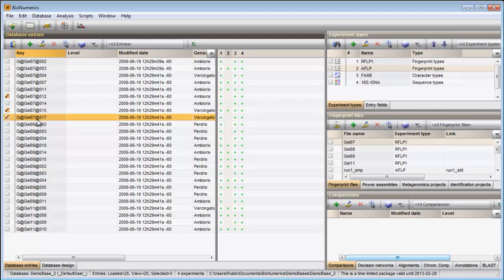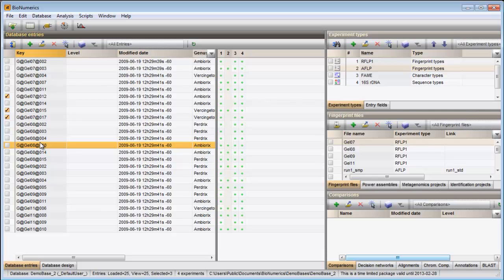With the shift key a whole group of entries can be selected at once. Click on the first entry, hold down the shift key and click on the last entry of the range.